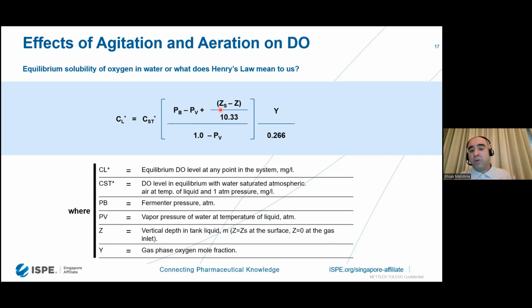But this is what you need. All this empirical calculation is what you need in order to calculate precisely how much milligram per liter, ppm or ppb, solubility of oxygen you have, dissolved soluble oxygen you have at hand.